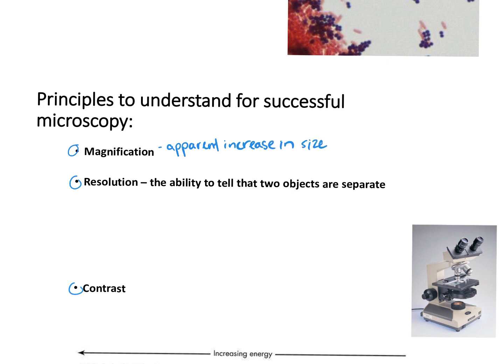And if we want to figure out the total magnification, we take the ocular lens and multiply that magnification times the objective lens to get the total magnification. Okay, so the ocular lenses, that's typically 10x. Should be printed somewhere on the microscope you're using, but that's most common. And then there's usually several different objective lenses. So for our scopes up in the lab, the ocular's 10. Say for the lowest power, that's a 4x. And so with that lowest power or the scanning objective in place, we get 40x for total magnification.